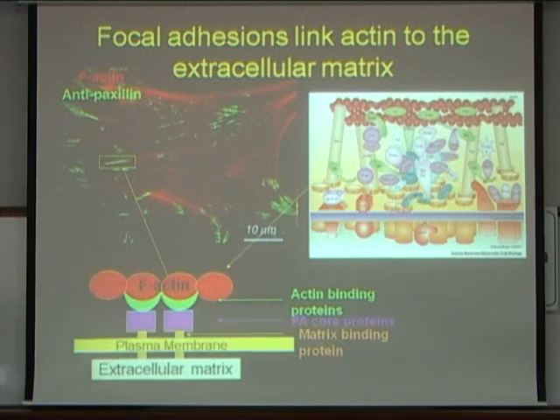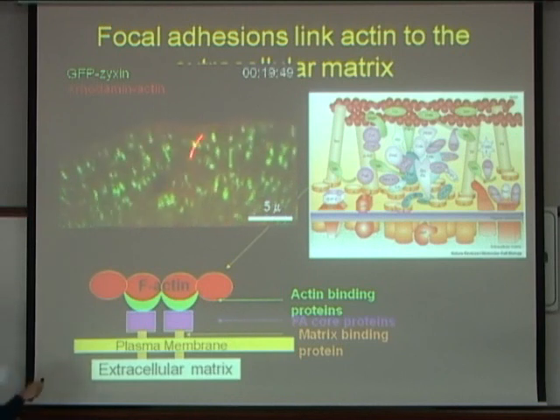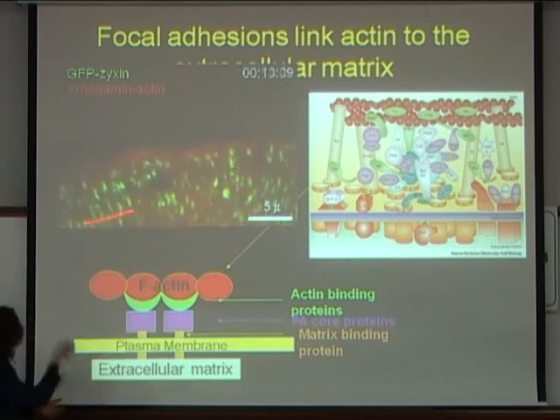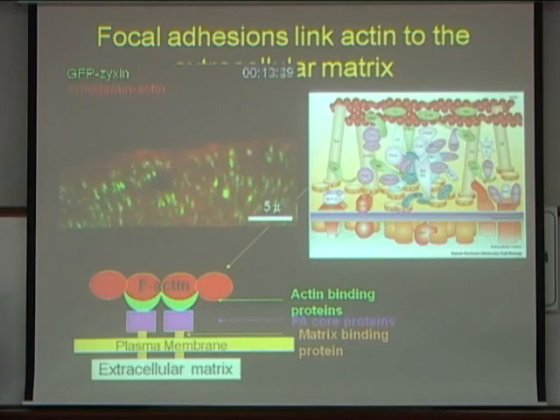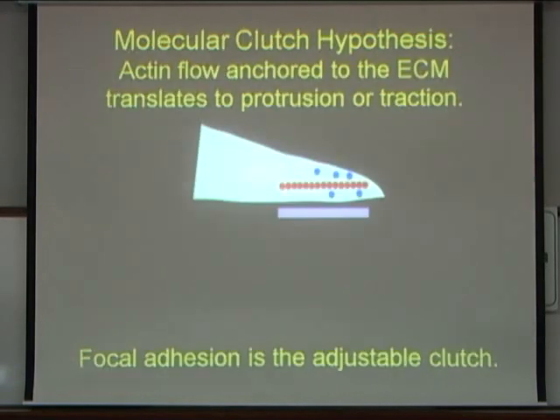So when you watch the dynamics of the actin cytoskeleton and the formation of these adhesion structures, what you see is this actin treadmill at the front and this slow retrograde flow behind it. But what you'll notice is that these adhesions stay relatively stationary with respect to the frame of reference of the movie, which is the substrate of the extracellular environment, and that actin sort of flows right over them. So how is the actin affected by its interaction with the adhesion, and how is motion transmitted through these layers of the proteins to generate force on the extracellular environment?